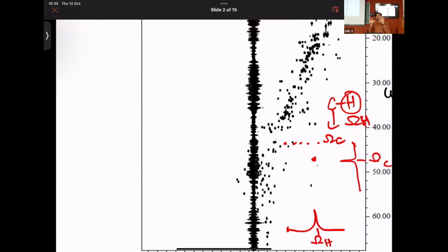So what you're seeing is something called a contour plot. Instead of seeing a 3-dimensional plot, you're seeing a 2-dimensional plot from the top down. Anything that says a contour, you can imagine like a mountain exists there, and we have just taken a projection of the mountain and we are seeing it. Okay, so wherever you see a peak, that indicates that is a CH bond that has a certain characteristic frequency.